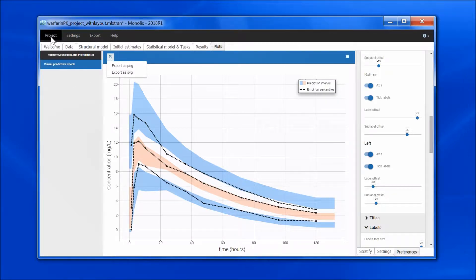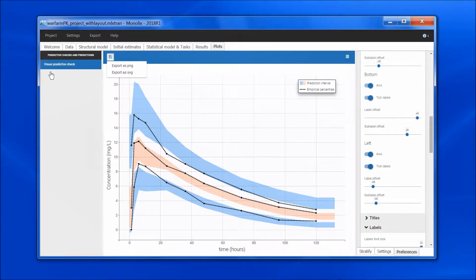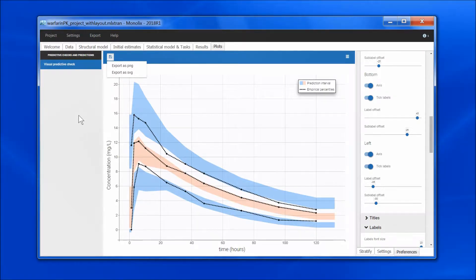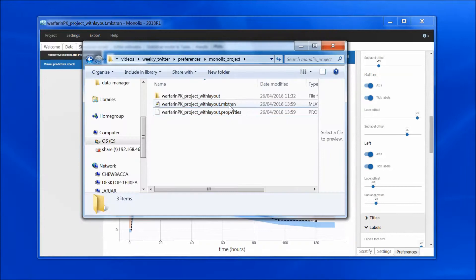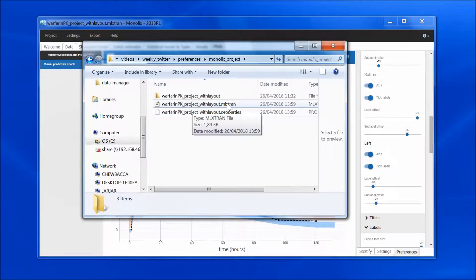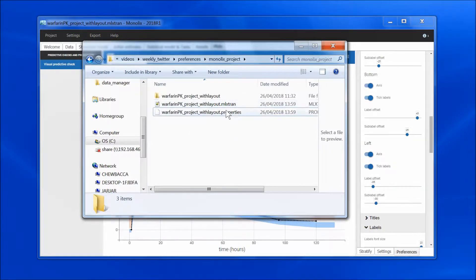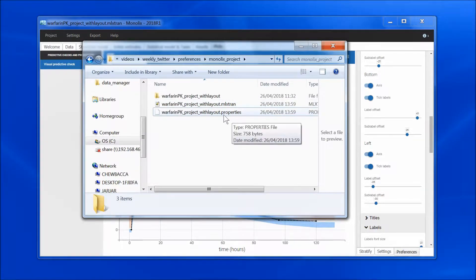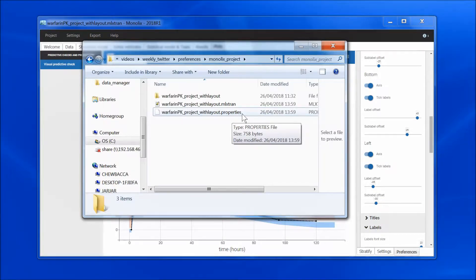If I save my project in project save, all the preferences will be saved with the project. That's here my mlxtran project, and all settings and preferences are saved in the .properties file that is saved next to it.